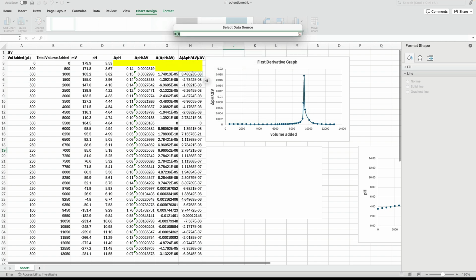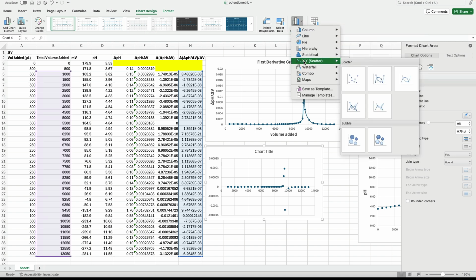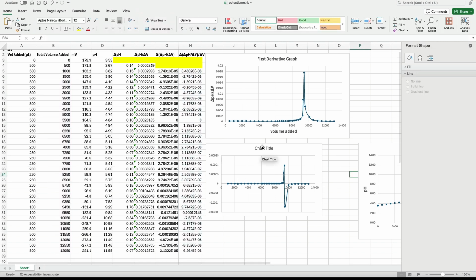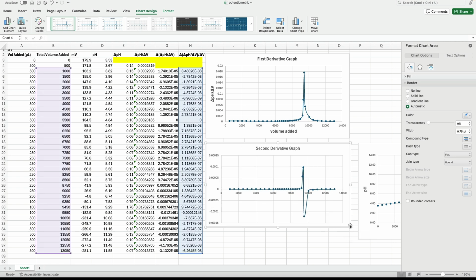The Y is going to be these. I actually take that back. For these, it really does help to do a scatter plot where you're connecting the lines, because then you can see what happens. So this is what we call the second derivative graph. A true second derivative would actually be if we had an infinite number of data points, but okay.